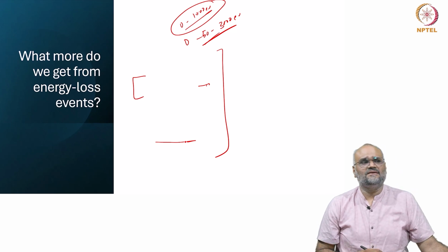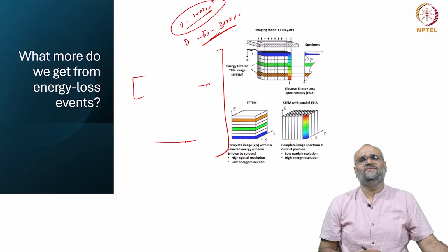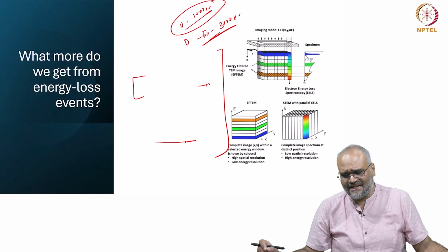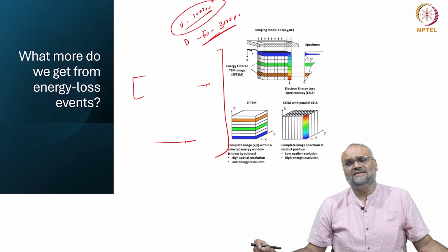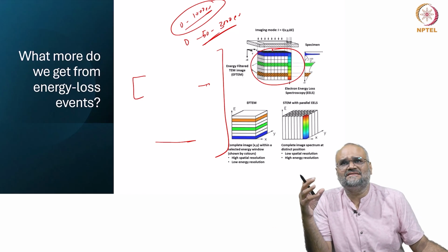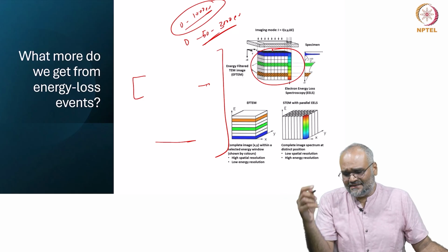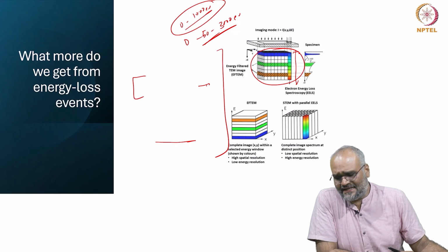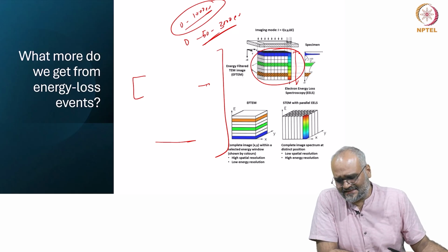So, if I look at what information I have from what happens after the electron beam interacts with the specimen, the data I collect that is forward scattered can be thought of as a cube, and I look at how the energy loss is over the z axis. This is just a conceptual sketch.